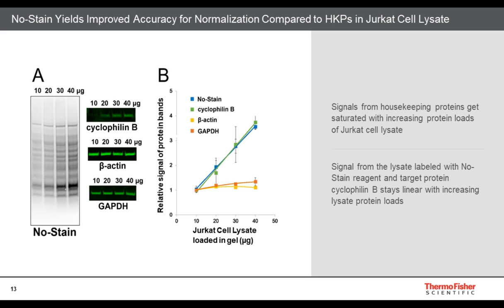So this is again a new set of experiments. Here we took the Jurkat cell lysate and looked at a different target protein, cyclophilin B.